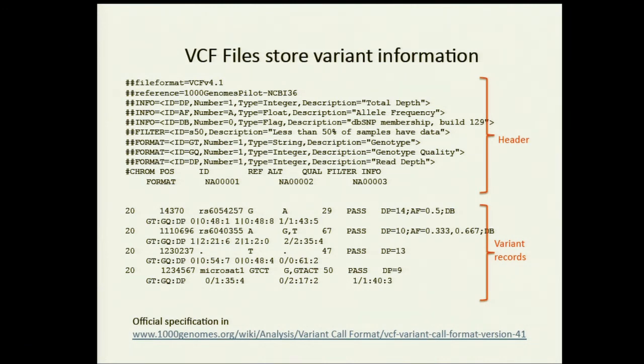Now we'll go to the next few fields. Quality is on the Phred scale, so we're approximately at Q29 confident. Again, Q30 is 99.9% confident, so we're 99.8% confident in this call. PASS is the filter field: is it good or not? Tomorrow, I think, Ryan will talk about filtering calls, and you'll see other things here that are not PASS. But for now, this is a passing record, and it's a good, real variant.